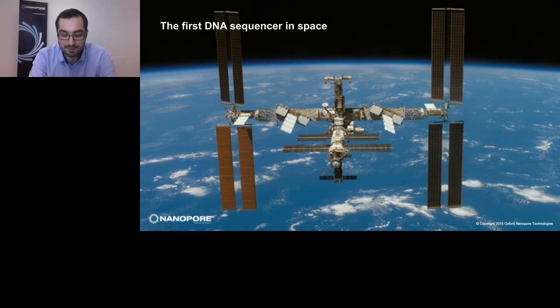At the moment, we don't offer data analysis software to deconvolute the epigenetic tags. But I believe that this is something that we're looking into and are in the process of trying to offer. But yes, you can see them. I think it takes a little bit of hacking at the user end to try and make use of the data. But it is in there.